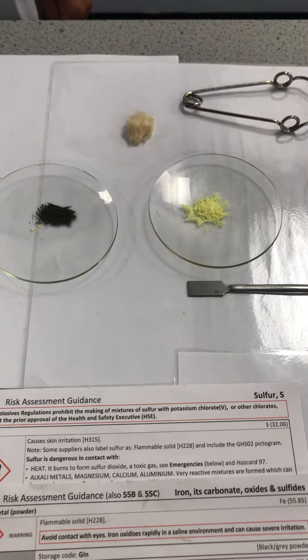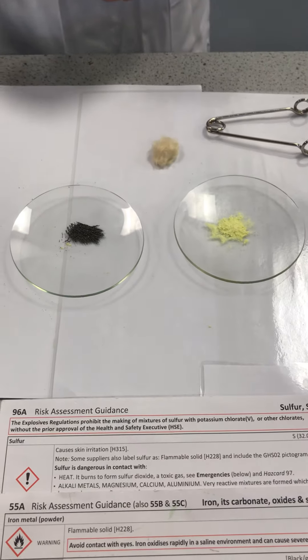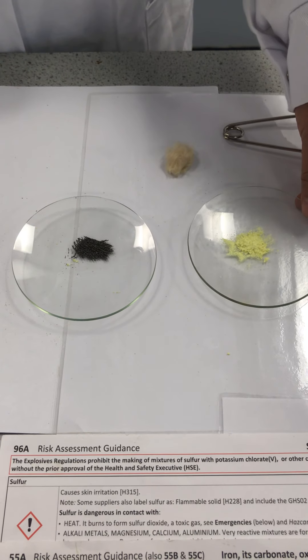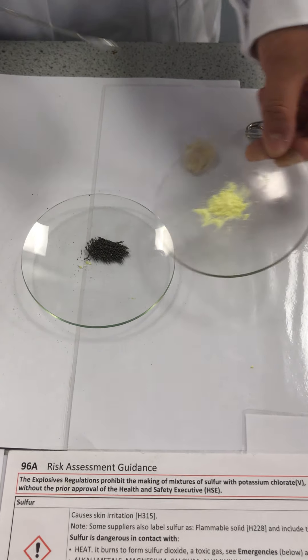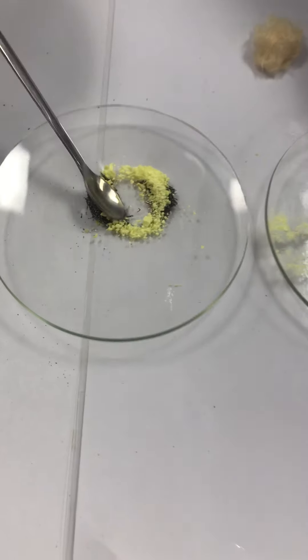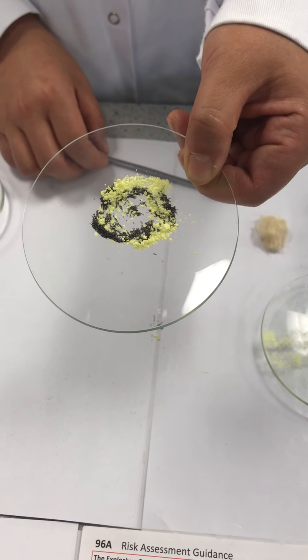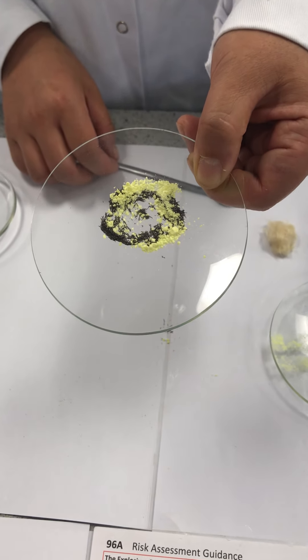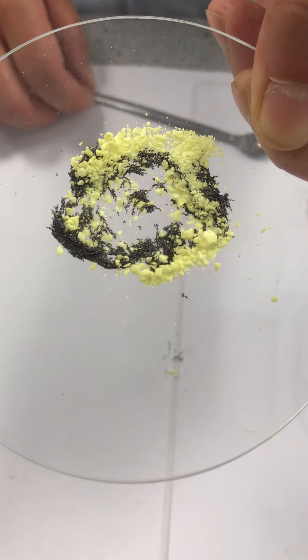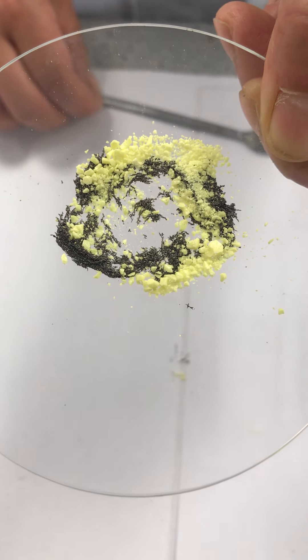Part three: making a mixture of iron and sulfur and trying to separate them. Some iron filings and sulfur powder are mixed together in a watch glass. Now we have a mixture of iron and sulfur. We can see in this mixture the dark gray crystals are iron filings and the bright yellow powder is sulfur.